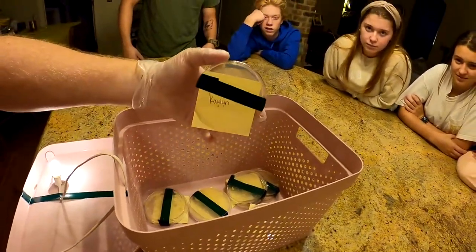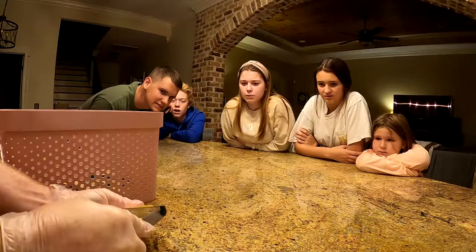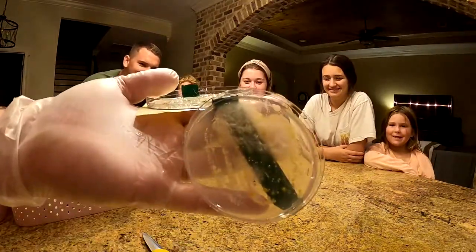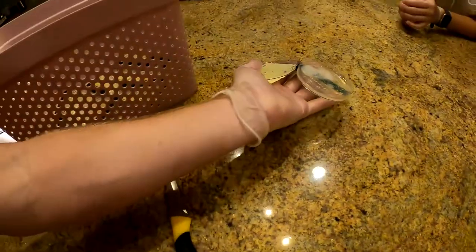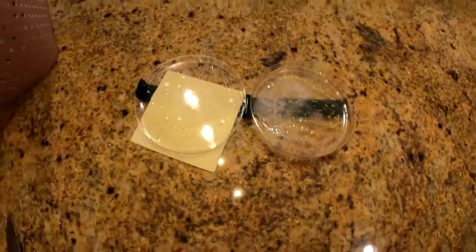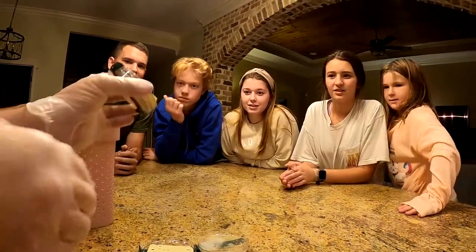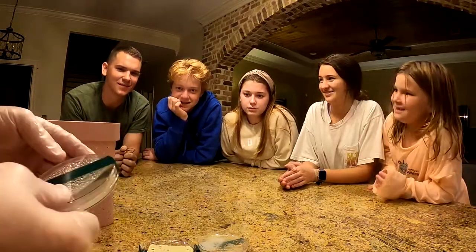Results time. First up is Kalen's — she swabbed her Apple Watch. The growth looks like spores and is really nasty. Next is the dog's mouth sample, and surprisingly, the dog's mouth is cleaner than the Apple Watch.